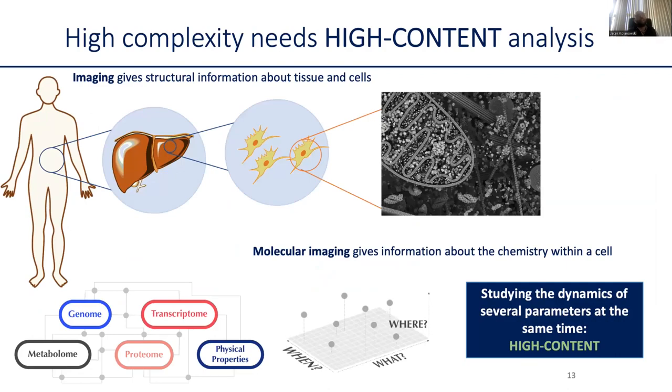Of course, as Kathy has already mentioned at the beginning of my talk, the biological complexity really requires us to be able to visualize multiple things at the same time. Because if we just observe a single element, then just seeing that element or studying its activity does not really tell us about the whole process, because the presence of this analyte might mean something else depending on its molecular context.